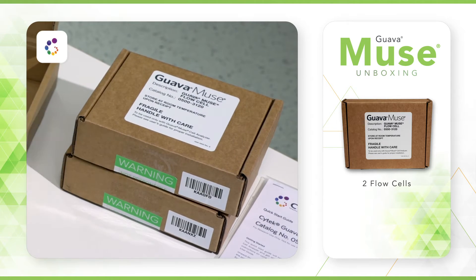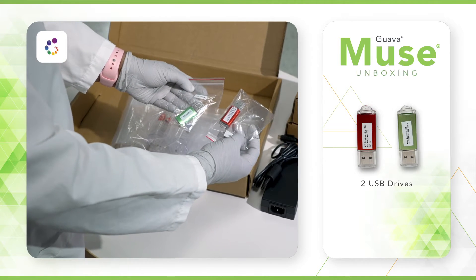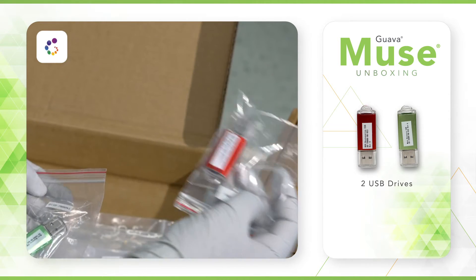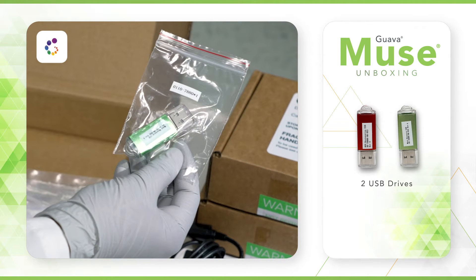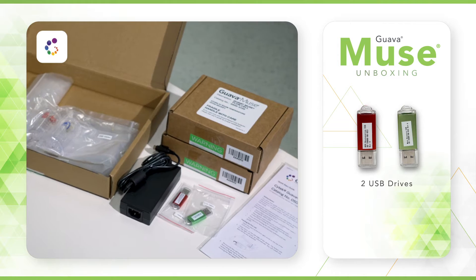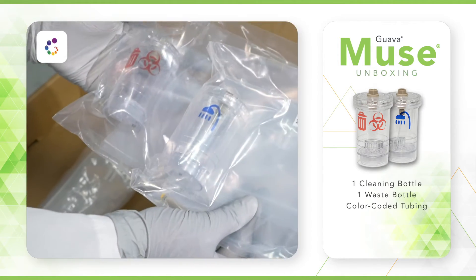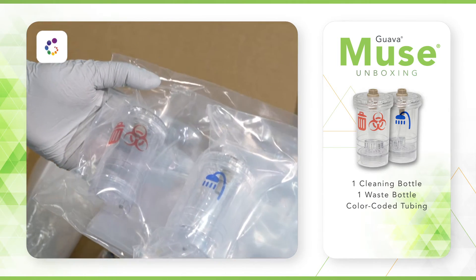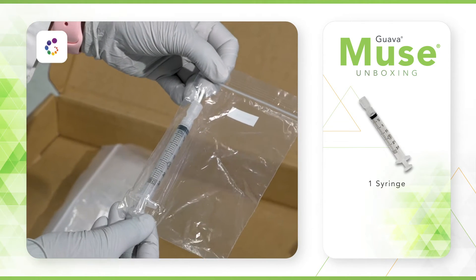There is also a power supply and two USB drives. The red USB drive contains recovery software should you need to reinstall. The green USB drive includes a copy of the Comprehensive User's Guide. We highly recommend that you refer to this document and read carefully before operating the instrument. A version of the User's Guide is also available online. Cleaning and waste bottles are clearly labeled with icons indicating their purpose and have corresponding color-coded tubing.